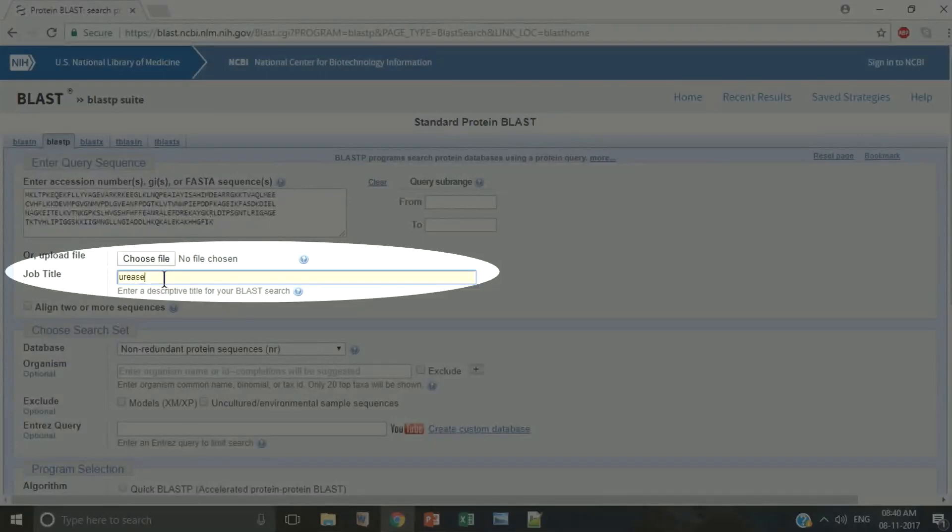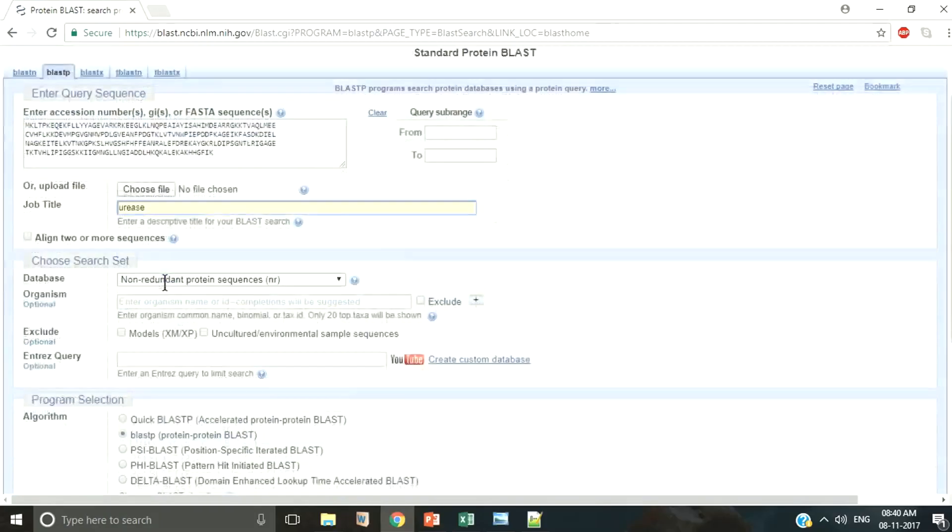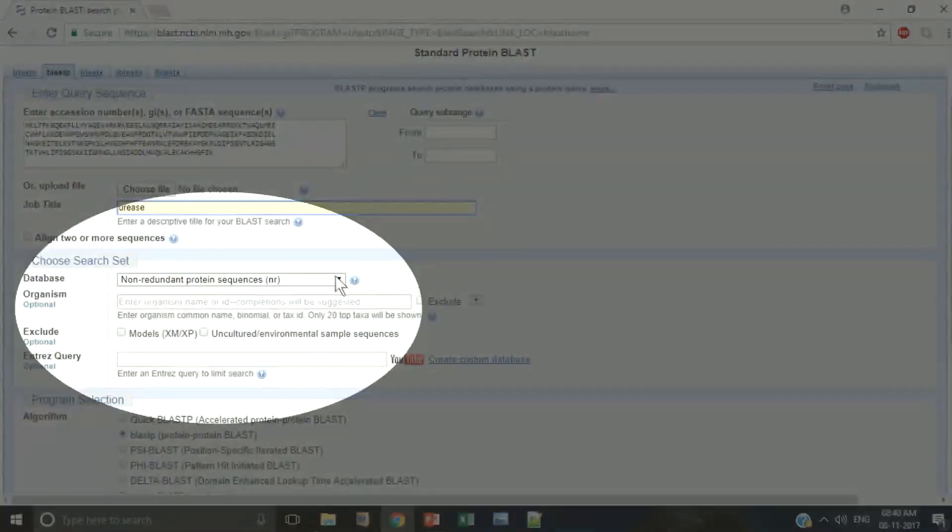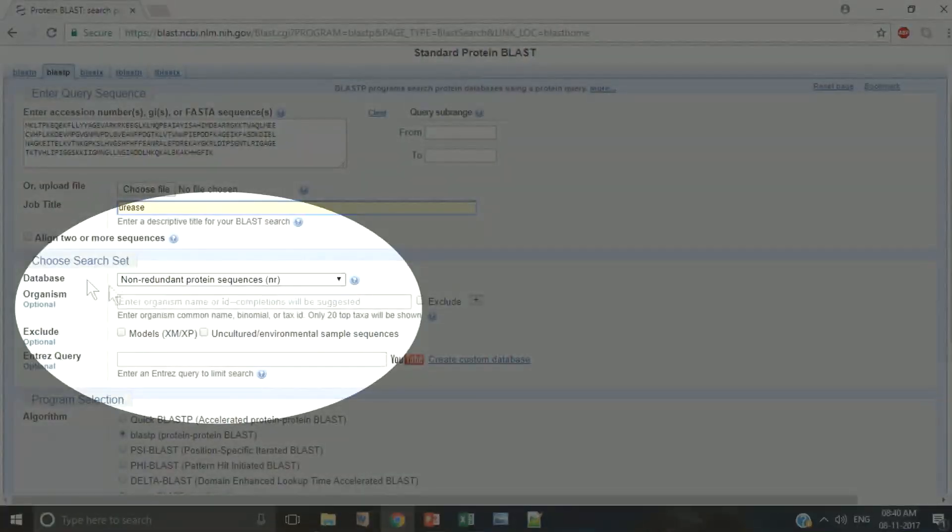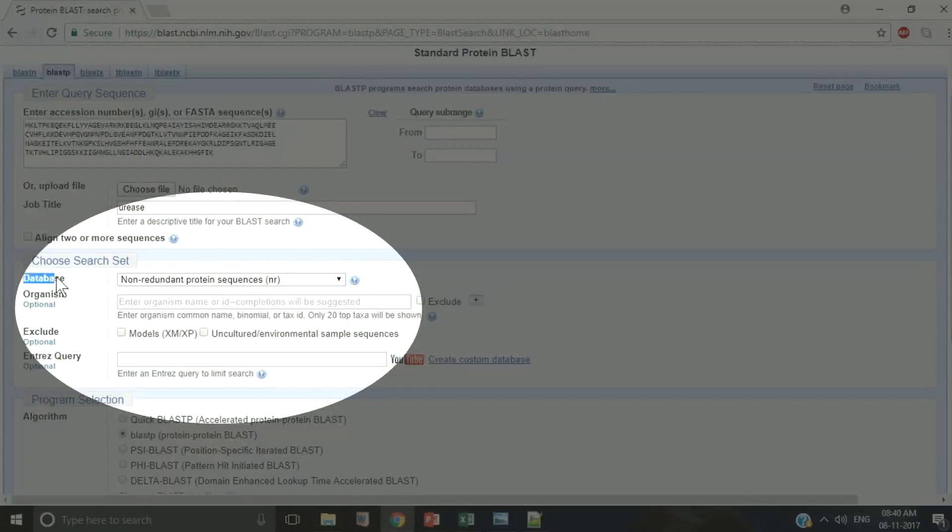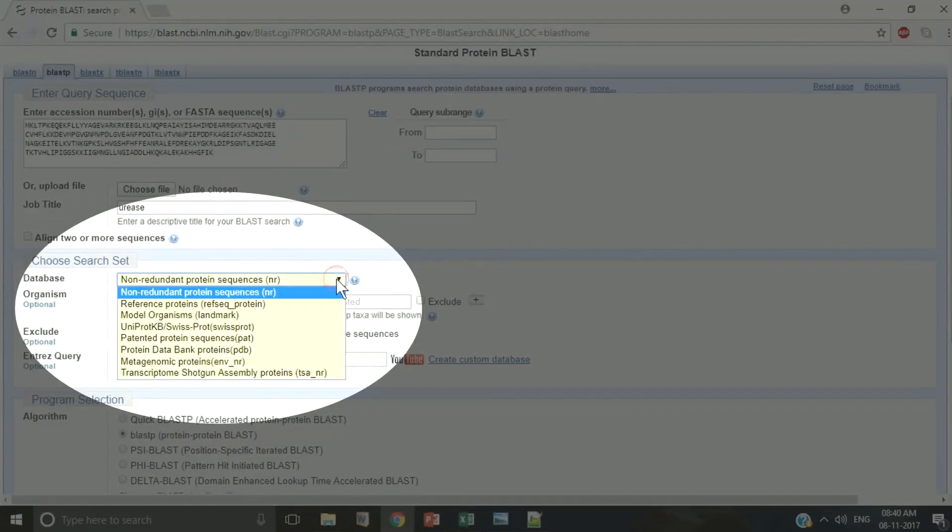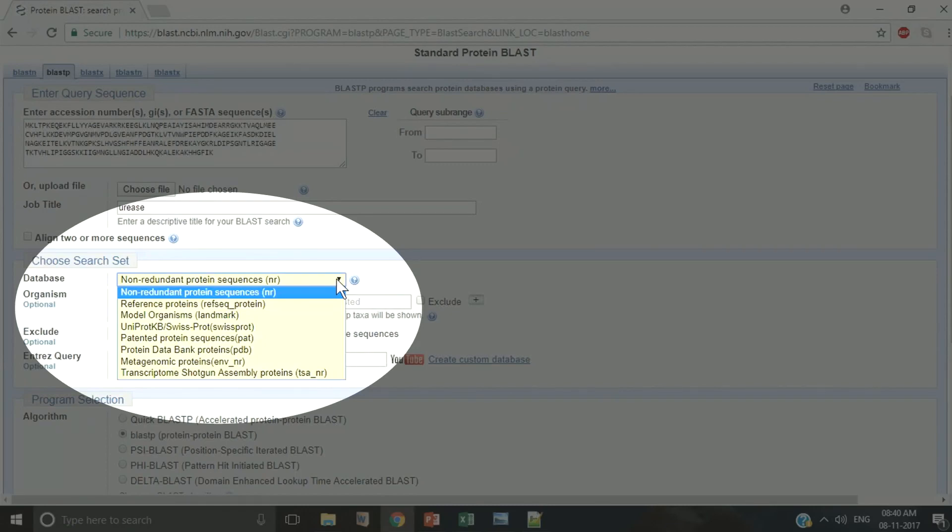Provide a name for your BLAST run. Now see there are different databases available for BLAST run. We have prepared an excellent video on which database to choose for BLAST run to help you with this.